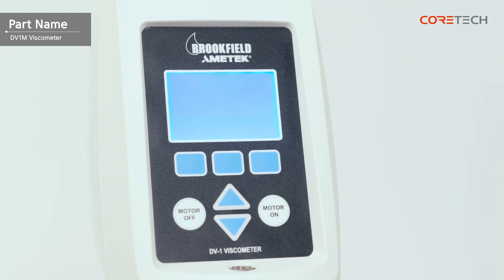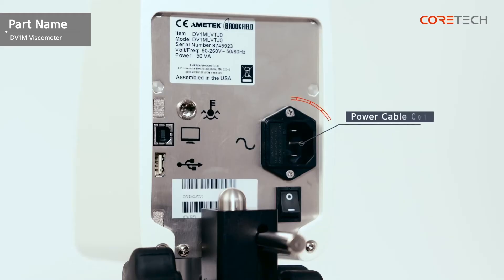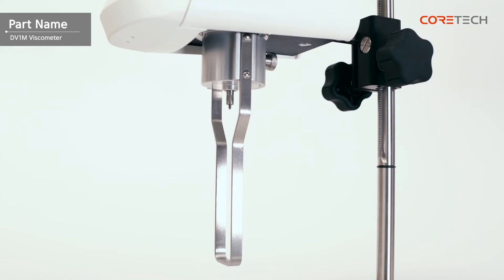On the front of the main body, there is a wide display, various operating buttons, and a bubble horizontal meter. Behind the main body, there are power cable connection ports, RTD temperature probe connection ports, USB Type B connection ports, USB Type A connection ports, and a power switch. At the bottom of the main body, there is a coupling screw that combines the pivot cup and spindle.